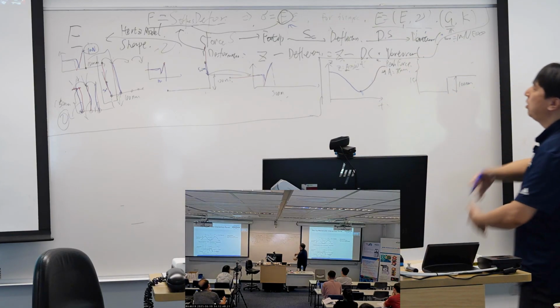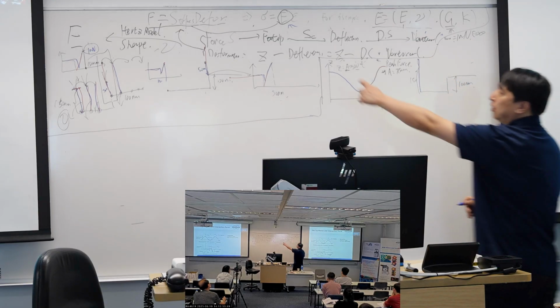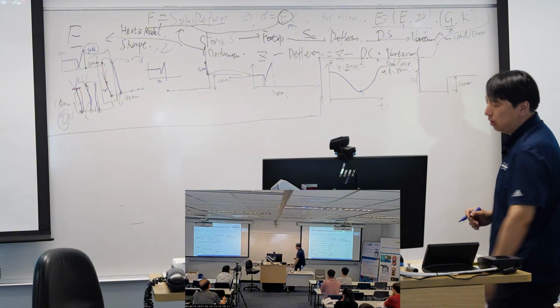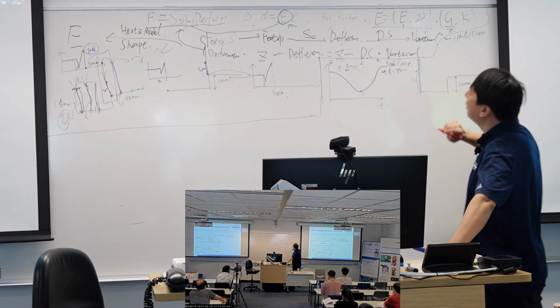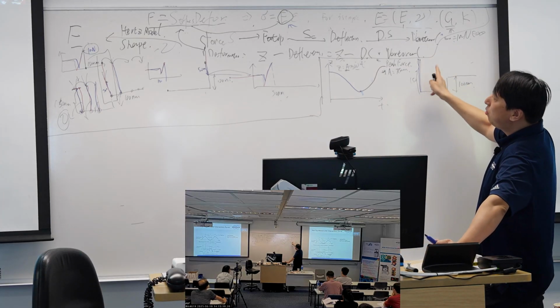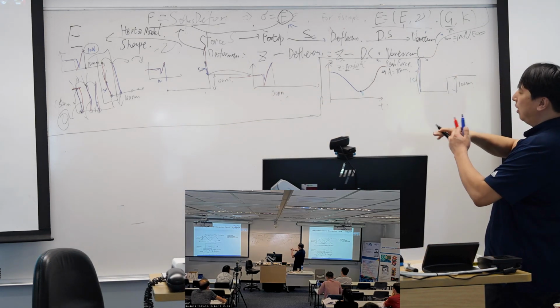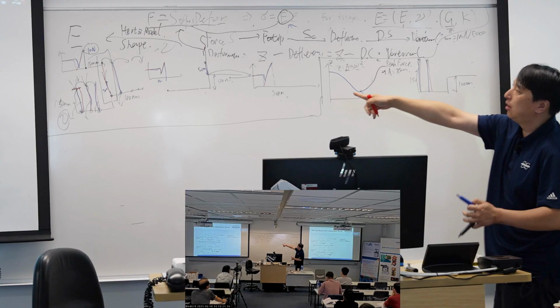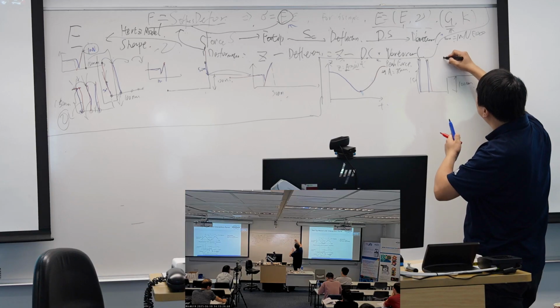So we can start the force curve. It's going down 150, we reach the bottom, and our force drops to 0. It's good. Then we retract 150, and we go back to this point. With the same principle as we did here, we have a jump. Then down, up. It's as simple as the example we had in the morning. So finally, we reach this point.